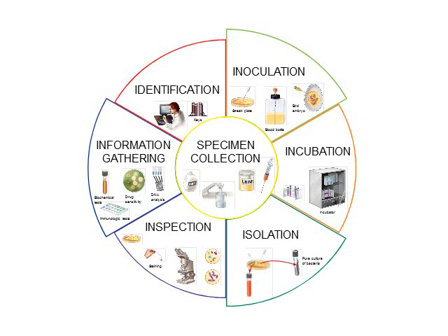After incubation, you can isolate certain bacteria colonies and just focus on those species of bacteria. Most of the time in lab, we're going to be working with pure cultures, but every once in a while, I may mix cultures together, so you have 2 different bacteria, and then you can actually isolate the bacteria from each other. After isolation, you can inspect your bacteria, so this involves using microscopes. We also are going to be using lots of different dyes to help us inspect the bacteria, see what they look like. And during that inspection, you can gather information. So information gathering is our 5th I.